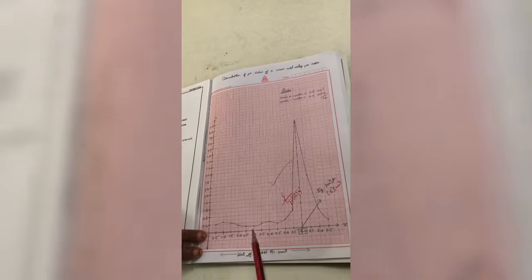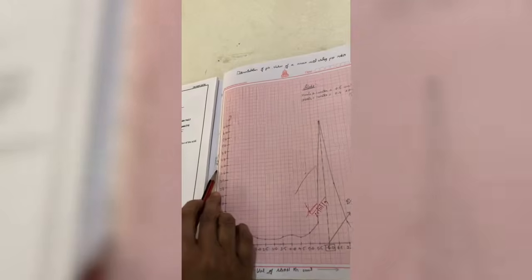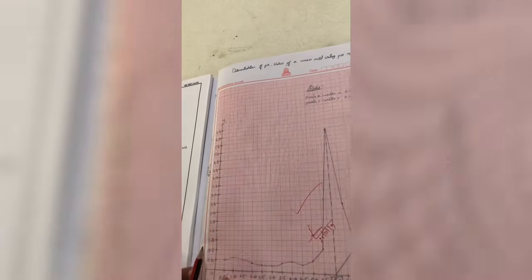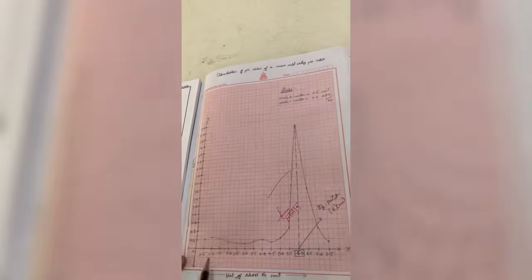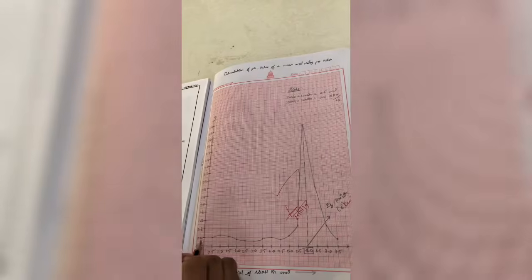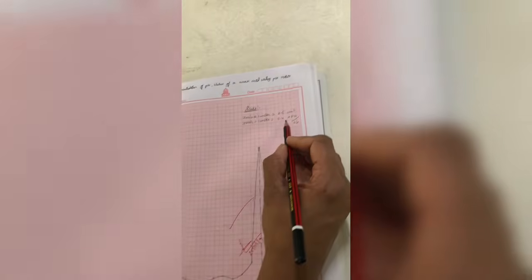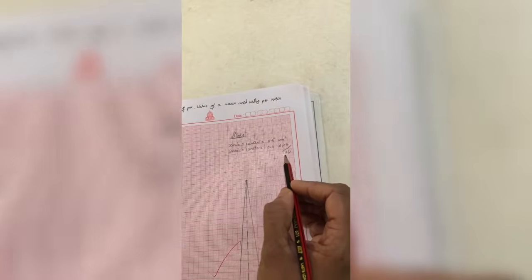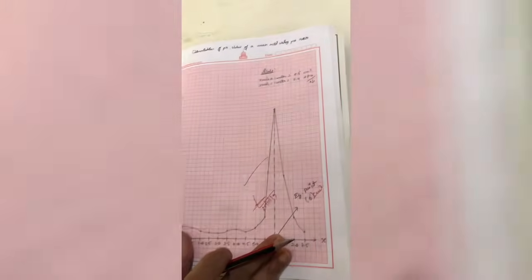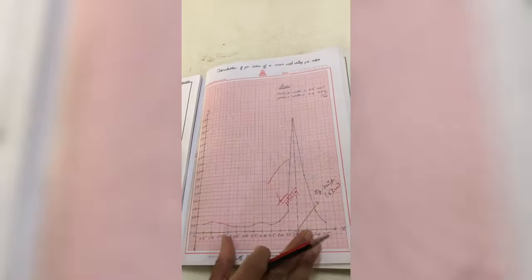The first graph you are plotting takes volume of sodium hydroxide on the x-axis and delta pH by delta V on the y-axis. You have to take the scale: each unit is 0.5 ml of sodium hydroxide added, and each unit on the y-axis is 0.4 of delta pH by delta V. I will send you the scanned copy of this graph. So for these readings, you fill the table and plot the graph.